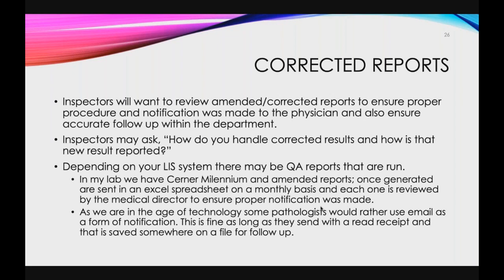Why was it corrected? Could we have done something differently? And how are we ensuring that we're giving the pathologist enough information so that this cannot happen? Was it something that they made a mistake on, or do we look in depth to see if we can decrease that number, if there's any?